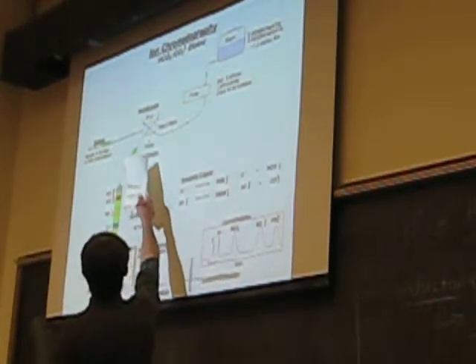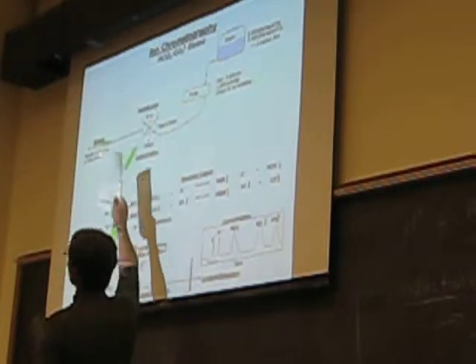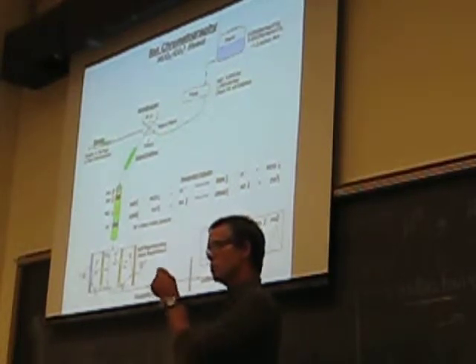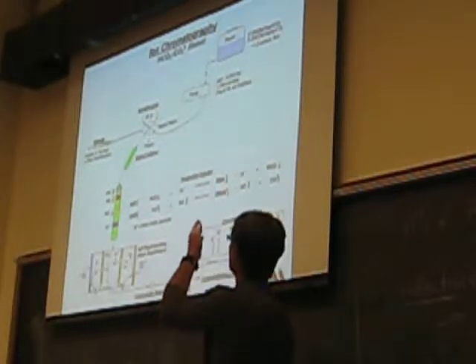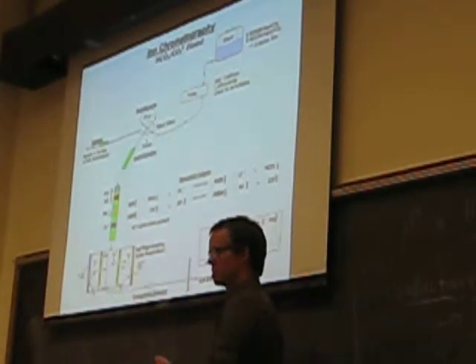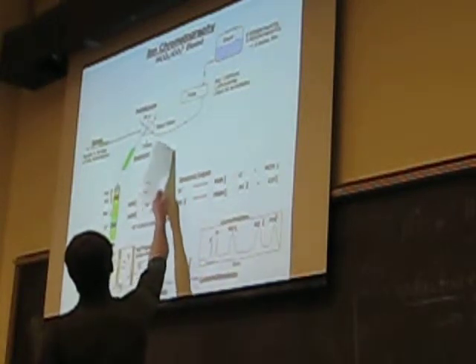They go through a sample loop, in which you've loaded your sample, in which case it's 25 microliters. These are details that you want to make sure you make note of, because that determines how much sample is put on the column, obviously. If you want more sensitivity, you could, in principle, change that out, and we have multiple sample loops, and put in a 50 microliter sample loop, or a 100 microliter sample loop. But yours is the 25 microliter sample.